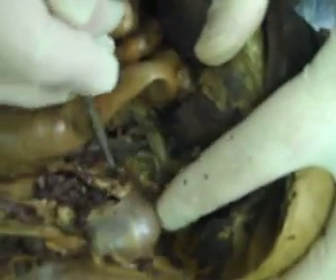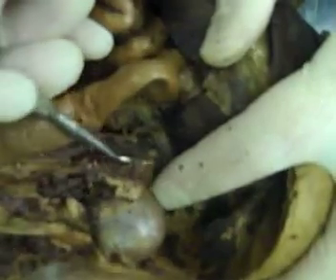The renal artery is down in here, but the vein is a lot easier to find, so that's generally the one that I pin. Renal vein.